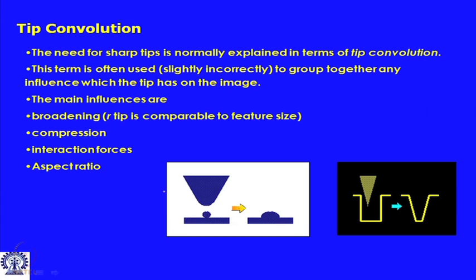So, this is the operating principle of an AFM, but one has to be very careful, because the image you are seeing is a rendered image.